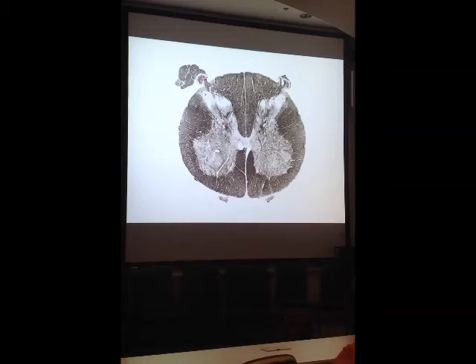Again, we see dorsal rootlets of spinal nerve actually attached to the cord. Here we see some ventral rootlets which have already detached from the cord. And then what major ascending somatosensory pathway would occupy a position through here? Spinothalamic tract. There would still be lateral corticospinal tract and some rubrospinal tract in here. There would be some descending motor control pathways displayed through these regions that we talked about on the previous 2 slides.